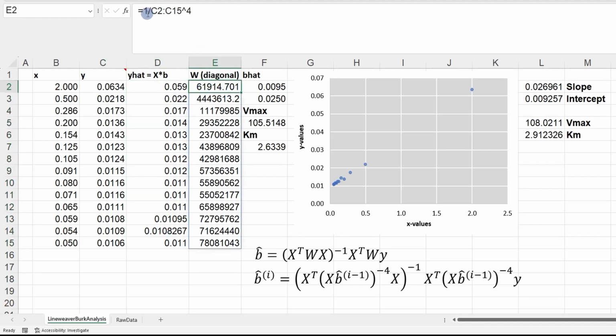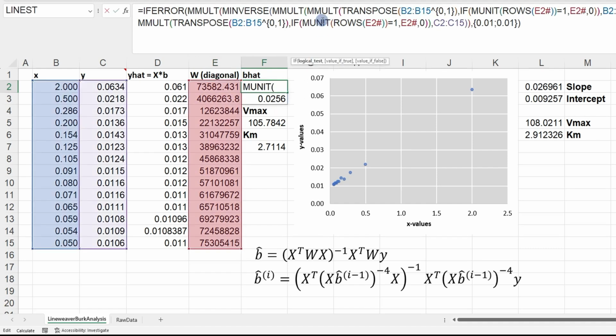And instead of using those, we simply, and I drag that here to the right, apply that y hat for the weighting. That only works if we have the iterative calculations activated in Excel. Otherwise, we would run into problems.